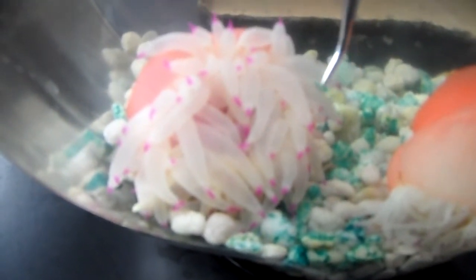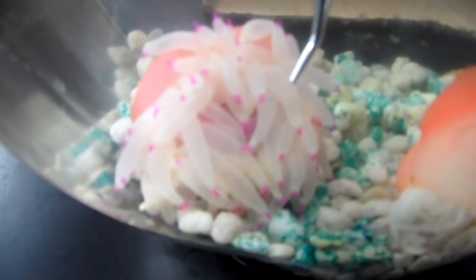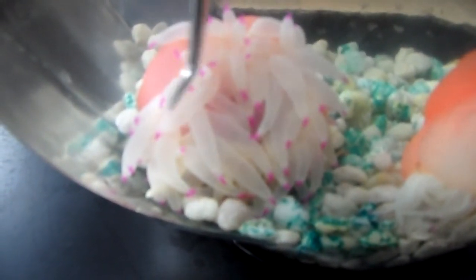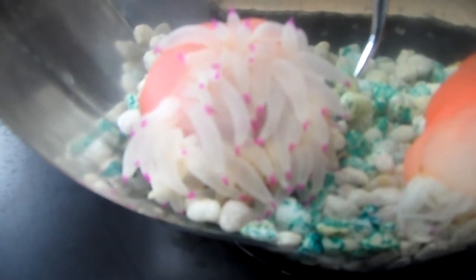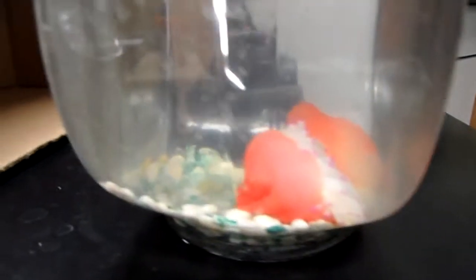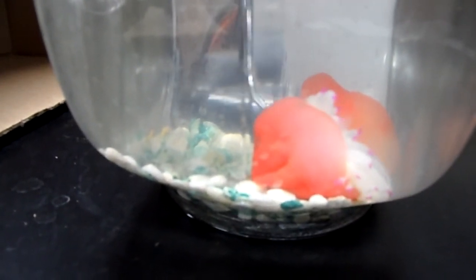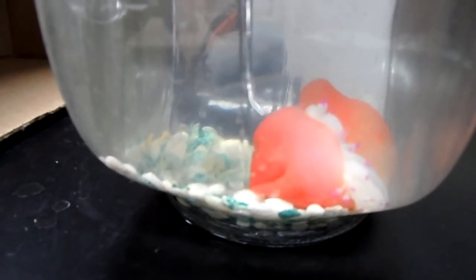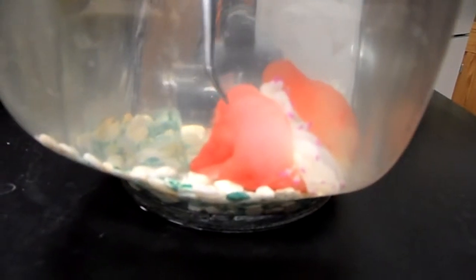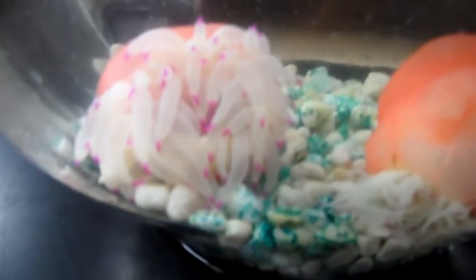Not seeing much of a reaction with light touch. Not seeing much reaction with any kind of touch. Let's try the body wall. It gets a little distorted looking through this side of the glass, but poke, poke. Not getting much of a reaction.